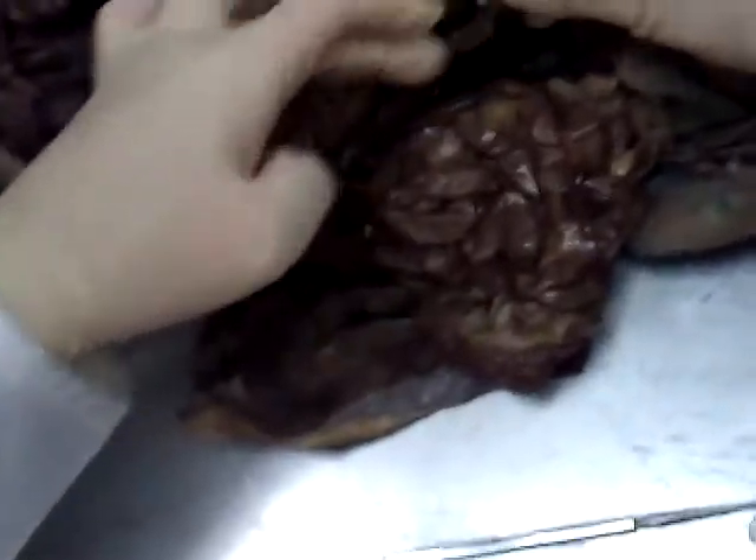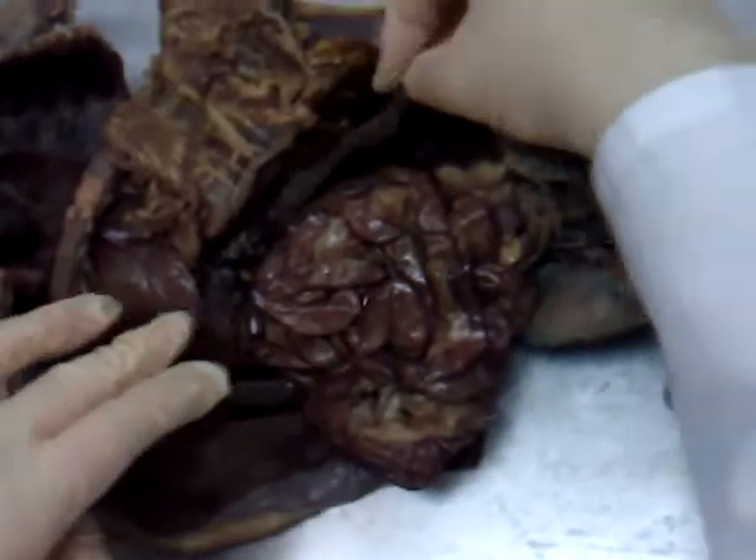Then pull the omentum back in this fashion. This first long, thin organ I'm holding in my hand right now — pancreas. Then we have three parts of the small intestine.